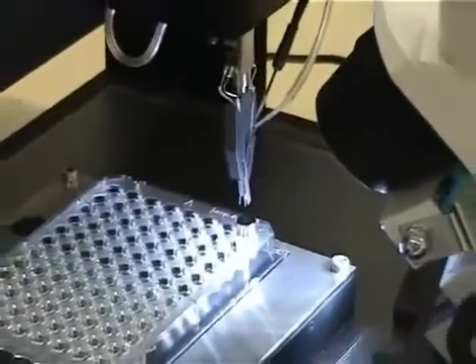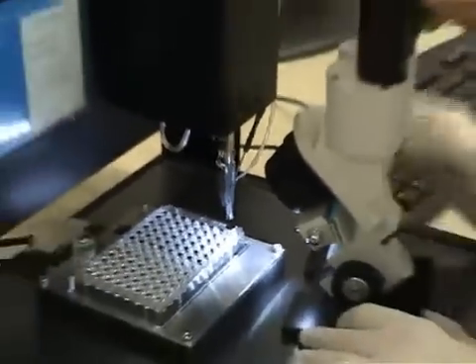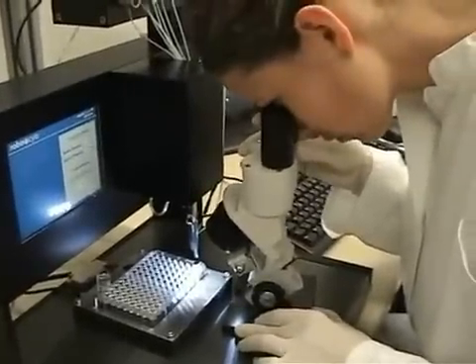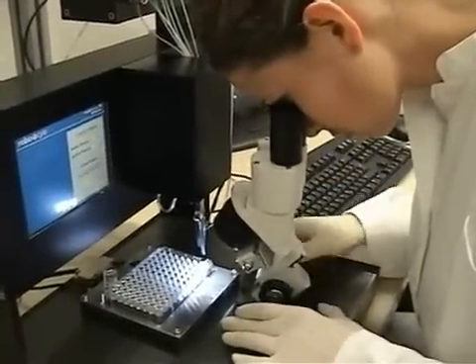The fluid flow is controlled by up to 16 valves or by an external liquid handler. Again, the alignment of the electrode tips to the well center ensures that the oocytes are hit precisely.